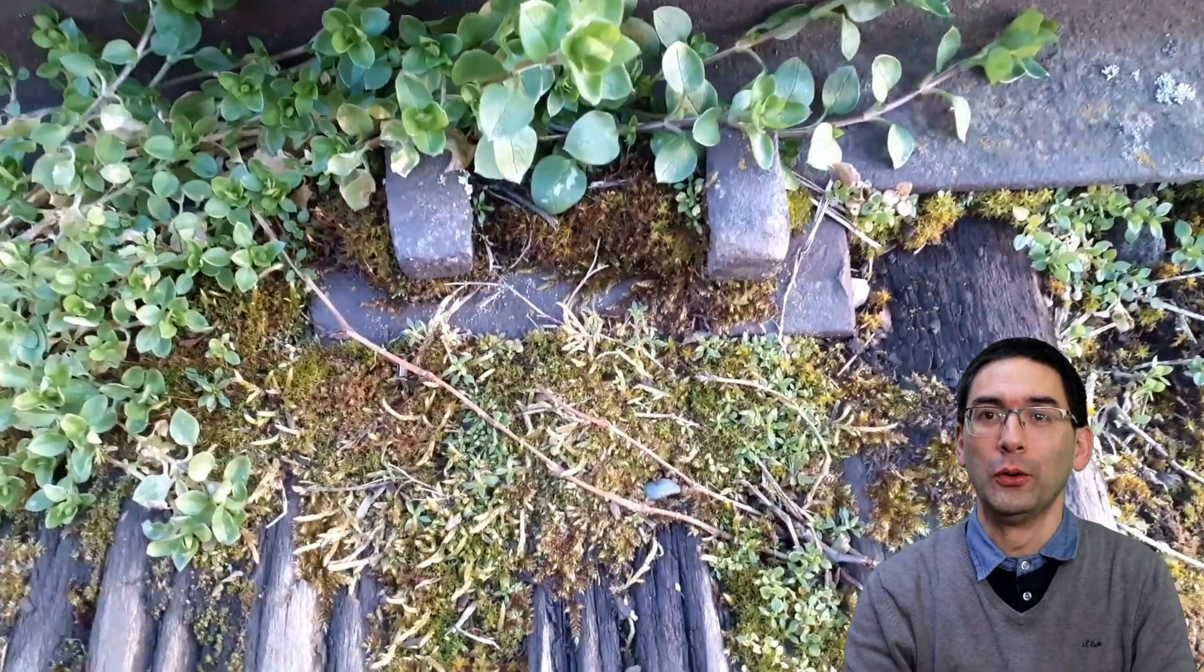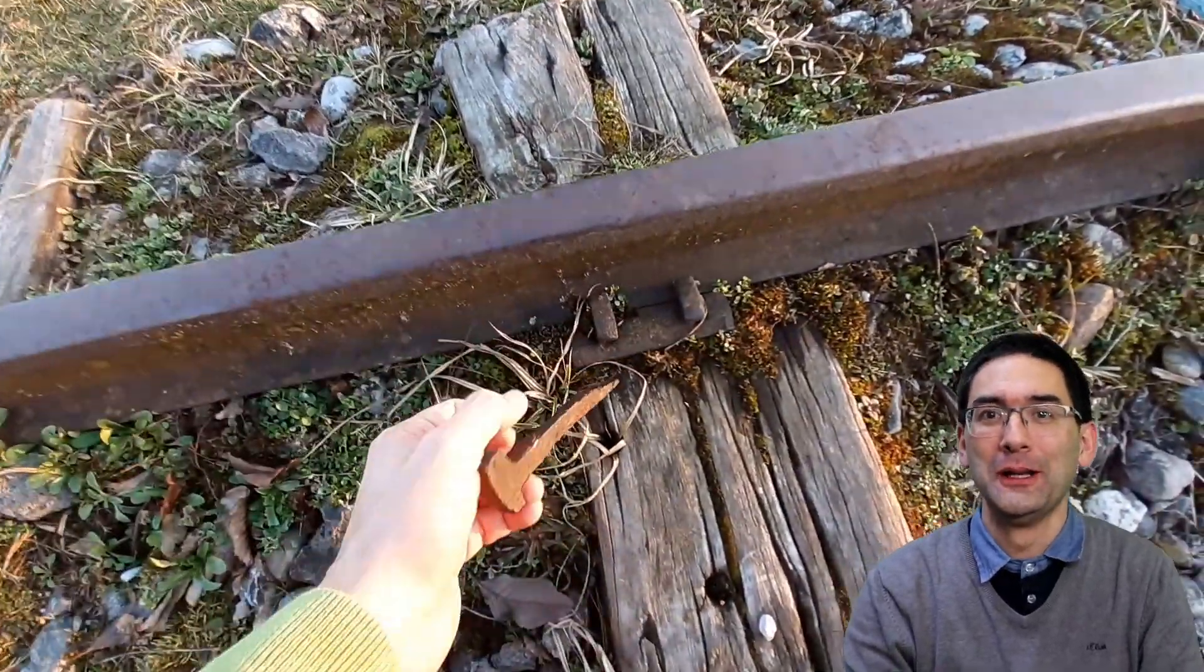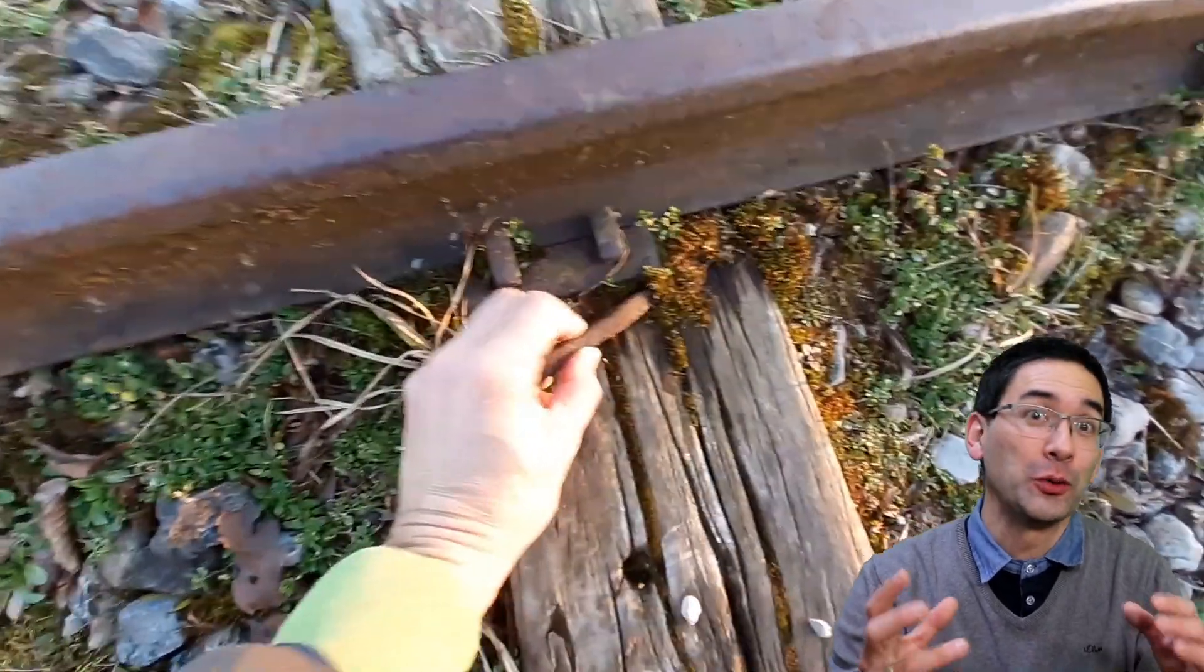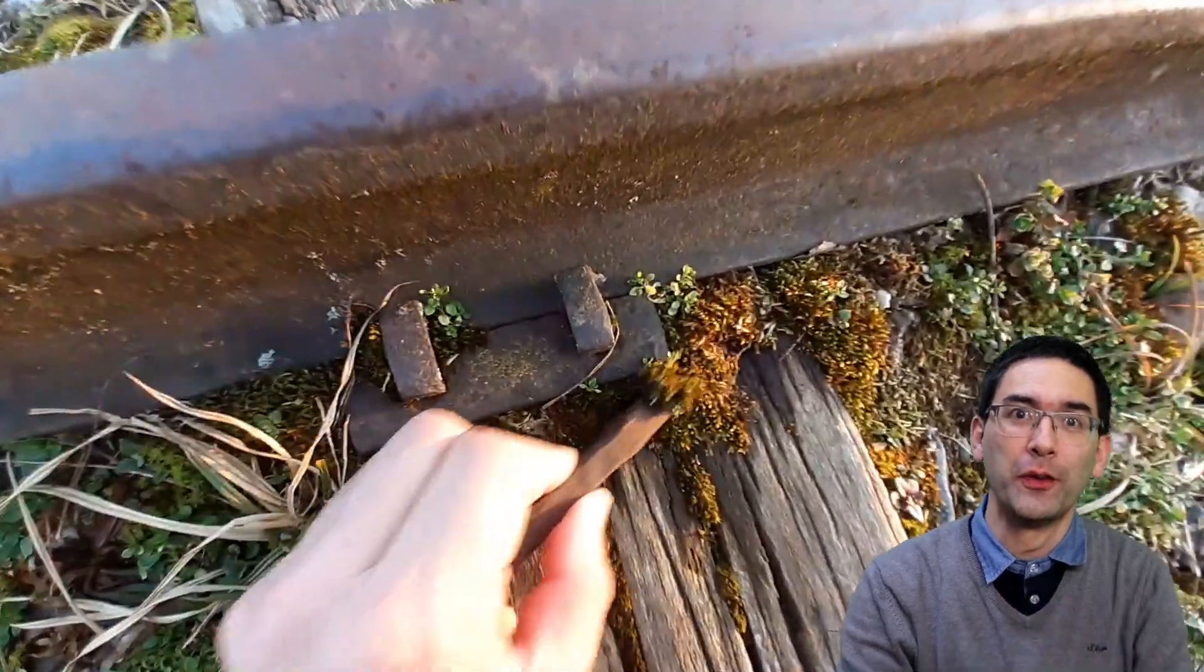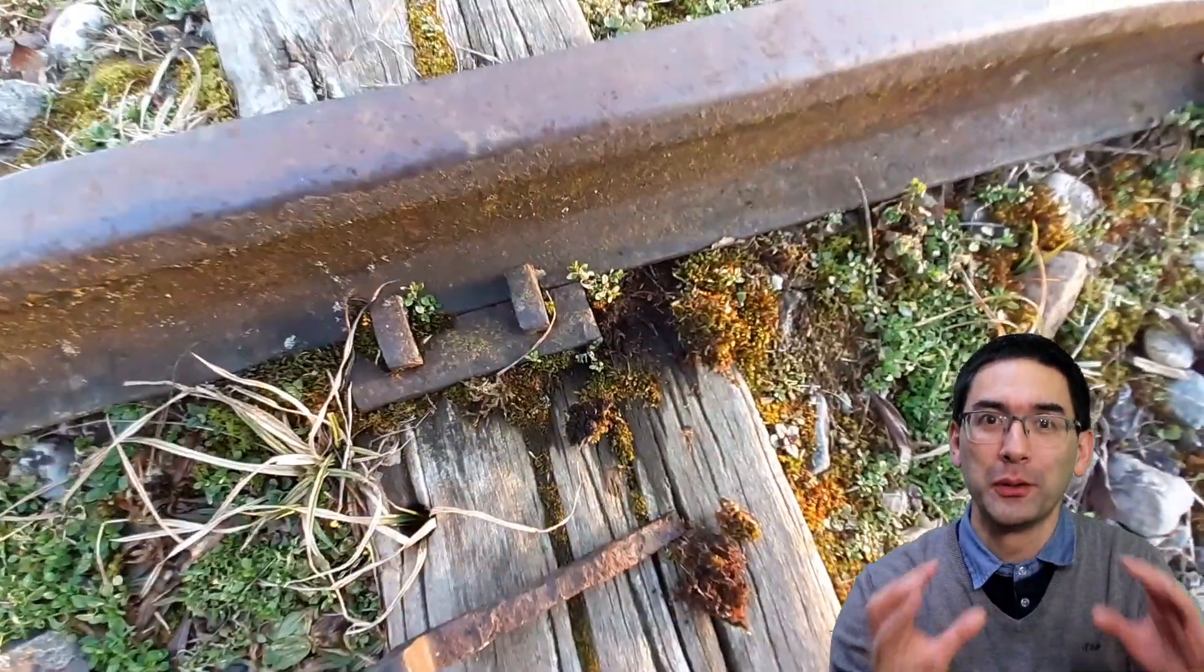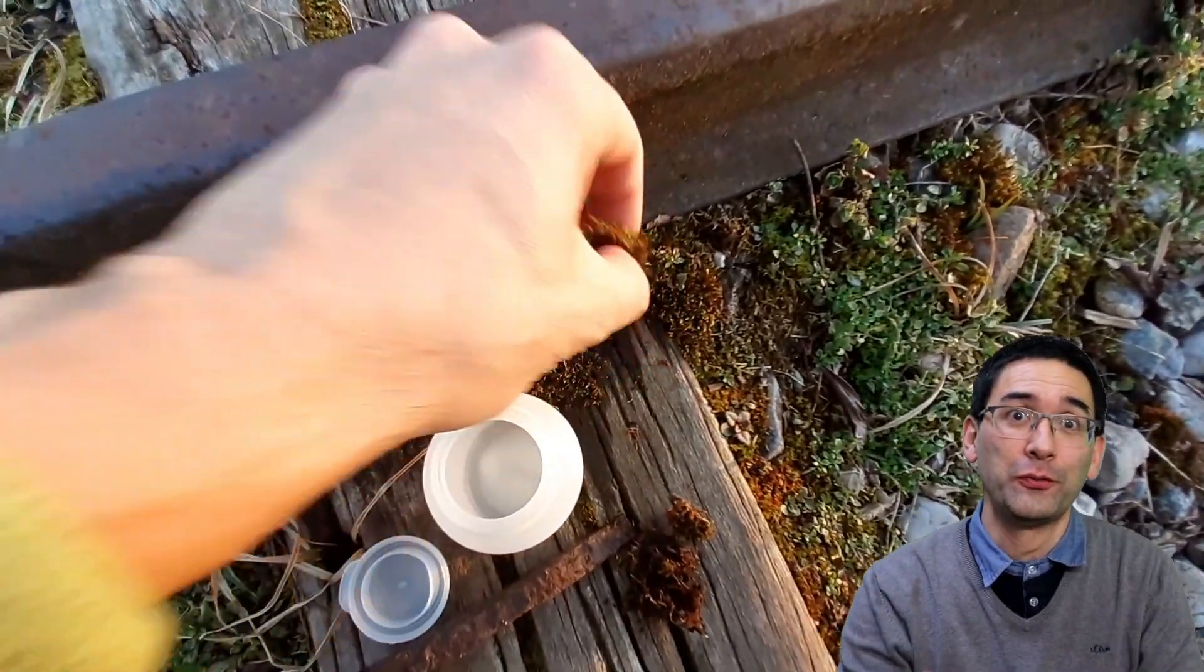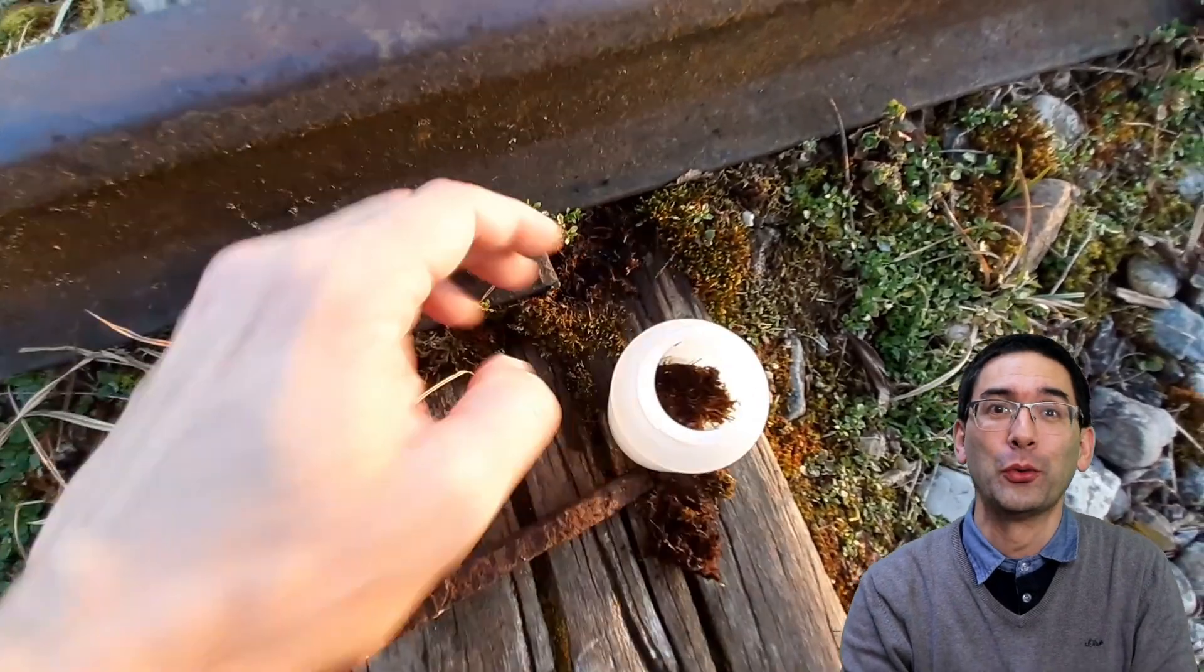Hi, Microbe Hunter here. Not to worry, the train tracks here have not been in operation for many years, but I think it's a good place to find moss and hopefully some interesting microorganisms. The train tracks are quite old with lots of moss growing on there. I found an old nail, maybe over a hundred years old, which was pretty good for collecting samples. Unfortunately, I did not find any tardigrades like I hoped, but there were a whole bunch of other interesting microorganisms in the moss.